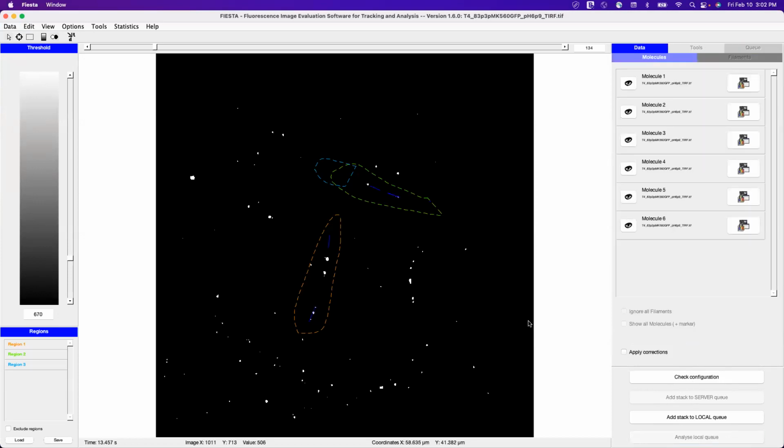Okay, I think that's about it. Yep. Yeah, that's Fiesta. Now, how do we end the record? Okay, so I have to play with it.